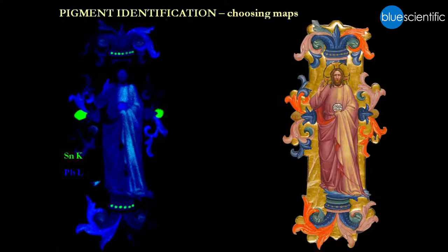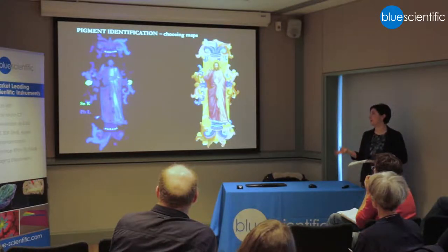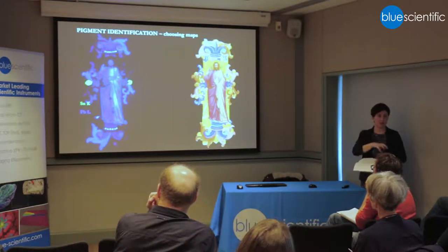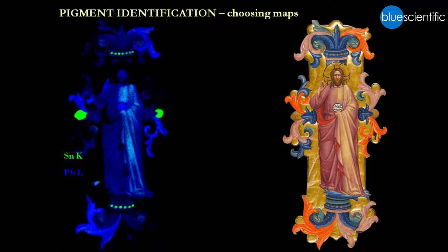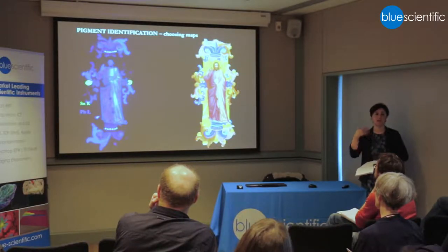For ease of analysis, I've combined two maps — it's a GB composite, just two channels. It really helps to look at them this way because I can hypothesize the presence of mosaic gold in the bright green areas where tin is present without lead. The whitish areas in the map are where both tin and lead are present, so I can hypothesize the presence of lead tin yellow. All the other areas, which are just blue, are going to be either lead white or red lead.